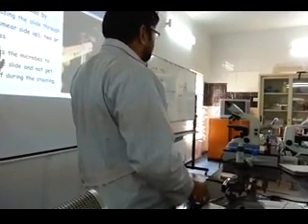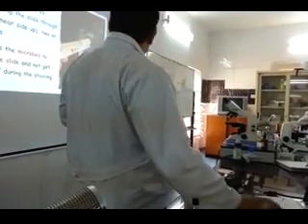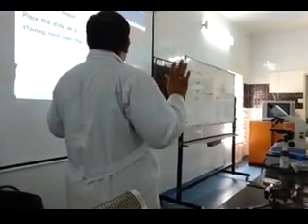Yes, everything else, but no distilled water. Okay? We'll do it, don't worry. Now, stain the smear. Okay?